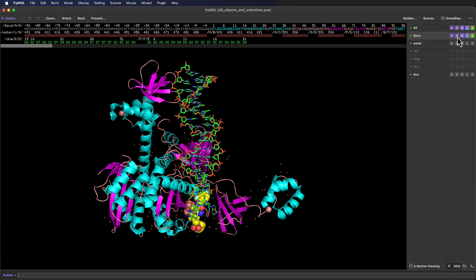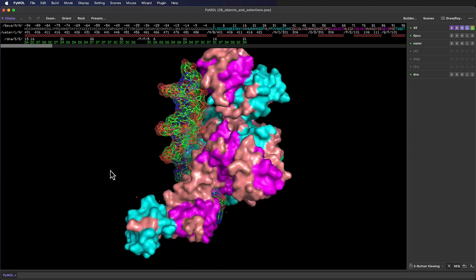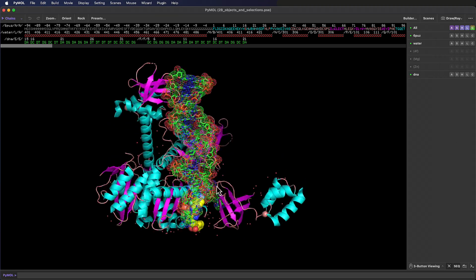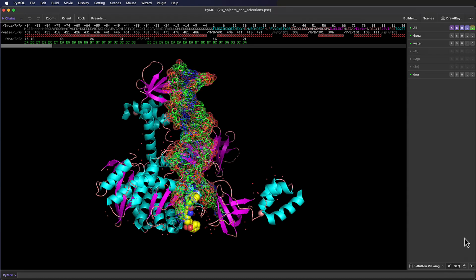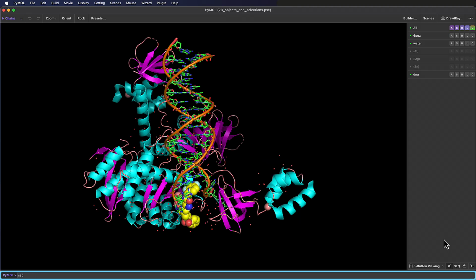This tutorial was a really high-level overview of a fraction of the things we can do with objects and selections in PyMol, and we've only really scratched the surface here. We mostly used the Graphical User Interface, or GUI, to create new selections, extract objects and apply styles in this tutorial, but you could perform all these actions by typing commands into the command input area or by writing a script to automate the process, and we will come back to this in later tutorials.